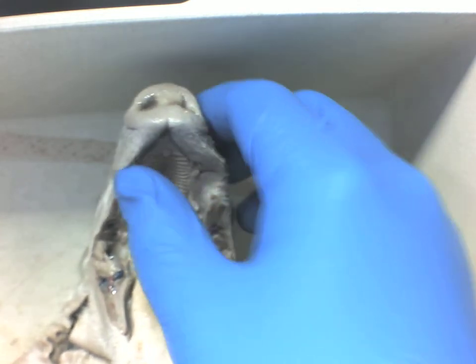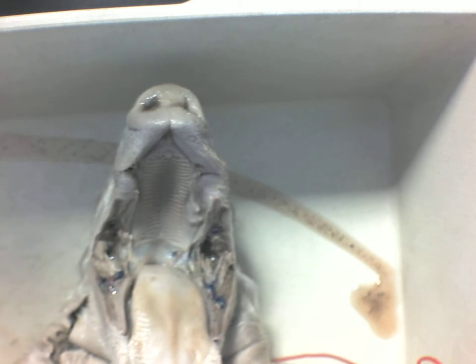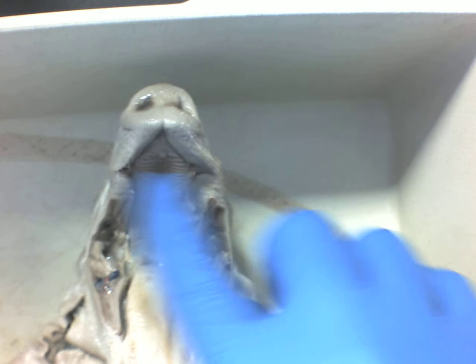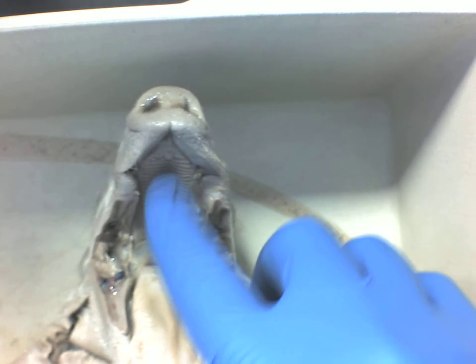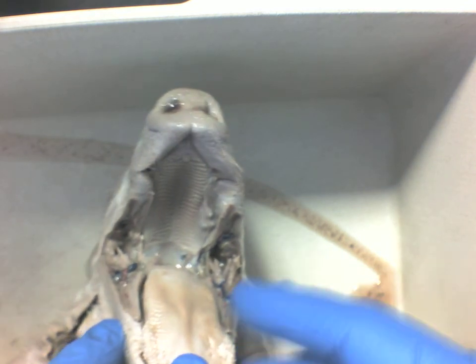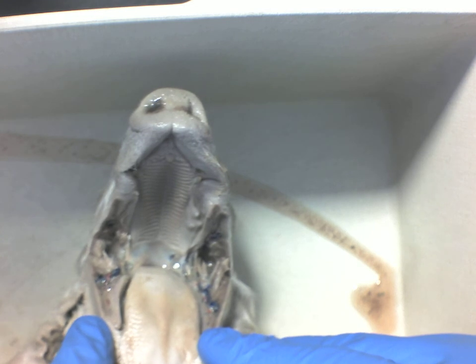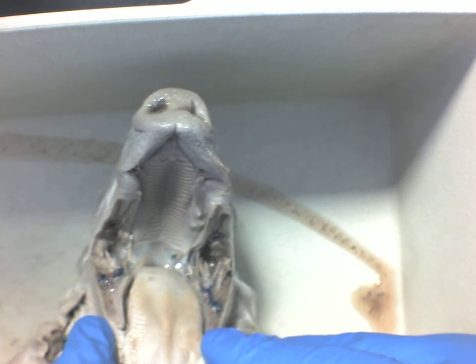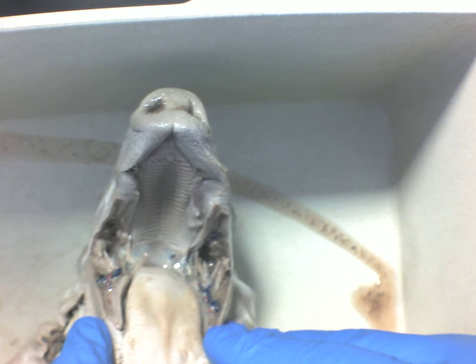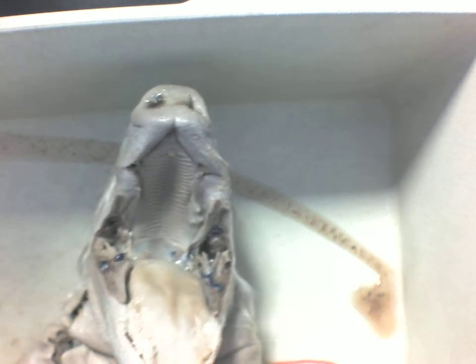We also have teeth. The teeth are used in what type of digestion? Mechanical digestion. Very good. Once the food is chewed up, inside of the cheek area and down low under the mandible are some salivary glands that are going to be producing saliva. What does the saliva break down in your food? The carbohydrates, very good. So the carbohydrates will be broken down.